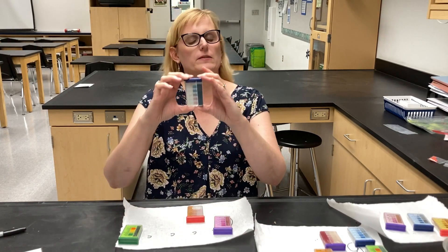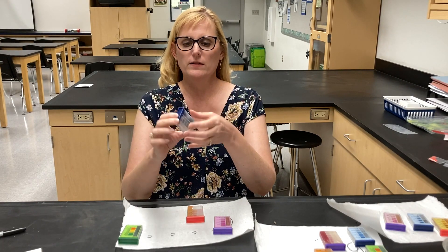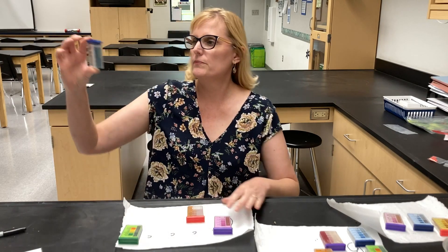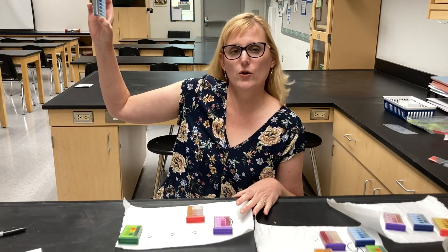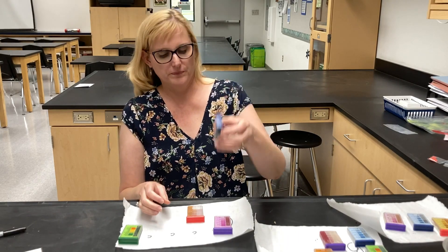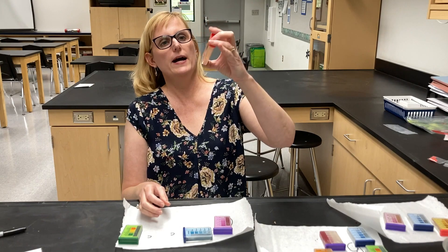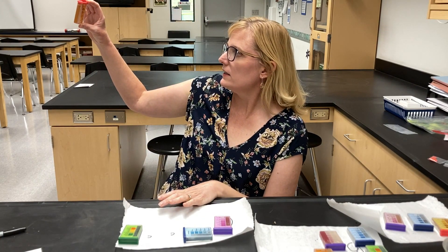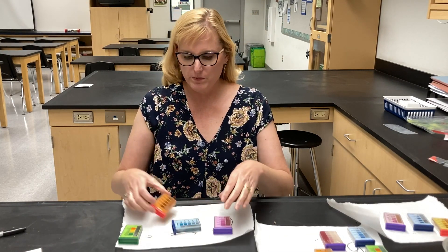Our phosphorus — again the blue doesn't like to dissolve as well, so I'm going to shake it up a little bit to get some of the reagent off the bottom. It looks to me to be adequate as well, it's a little low. And then this one has an orange color and it looks to be adequate as well — right about the middle.